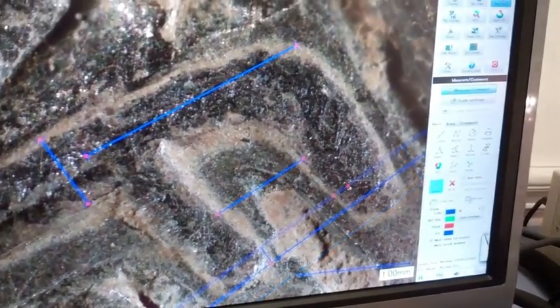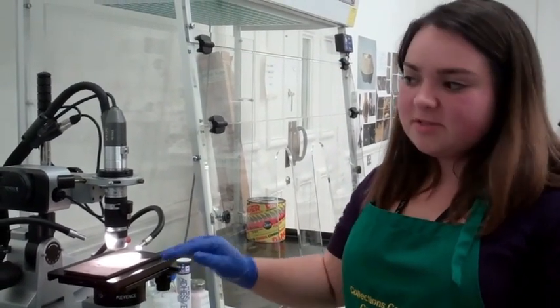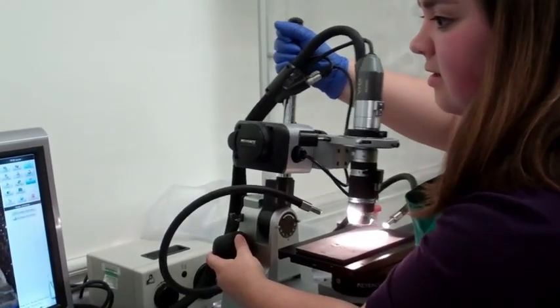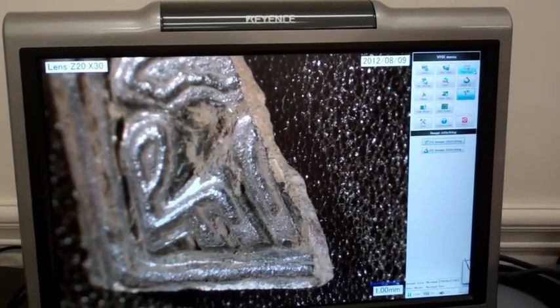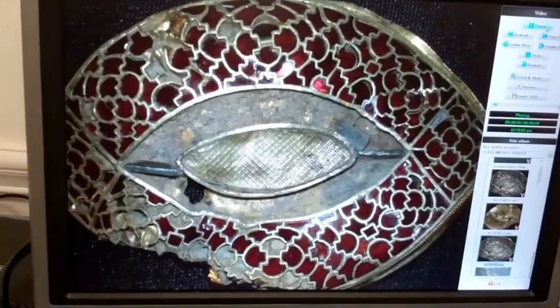We can also share these images with researchers so that they can look at technology or certain types of corrosion to tell what is going on with an object. In addition to being able to move the stage left and right without moving any fragile objects — which is especially good because the yellow tends to be fragile — we can also move the camera to see side images of, say, this strip, so we can see the edge here in focus without having to move the object.